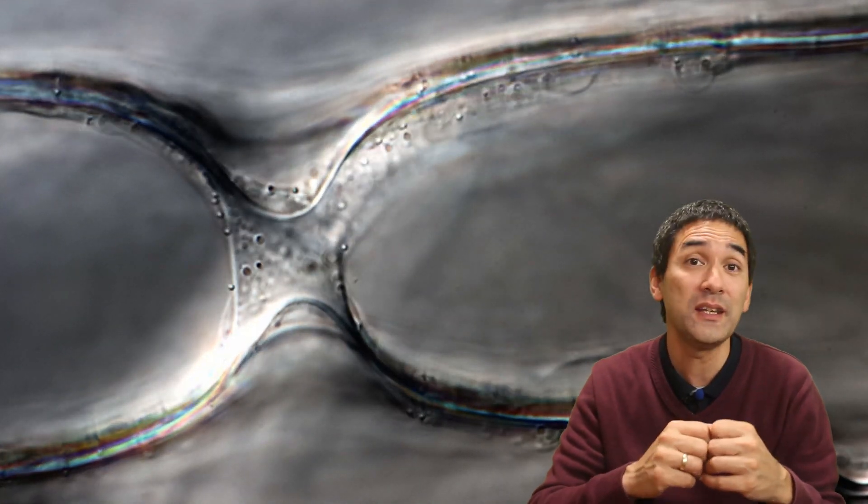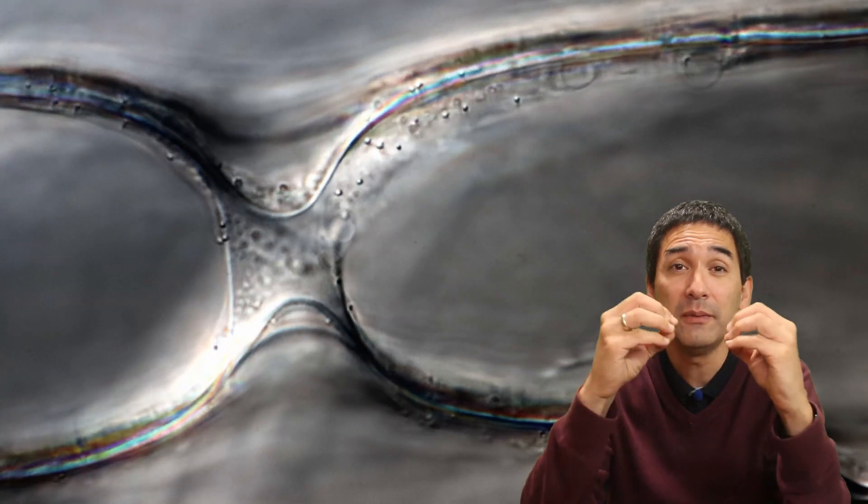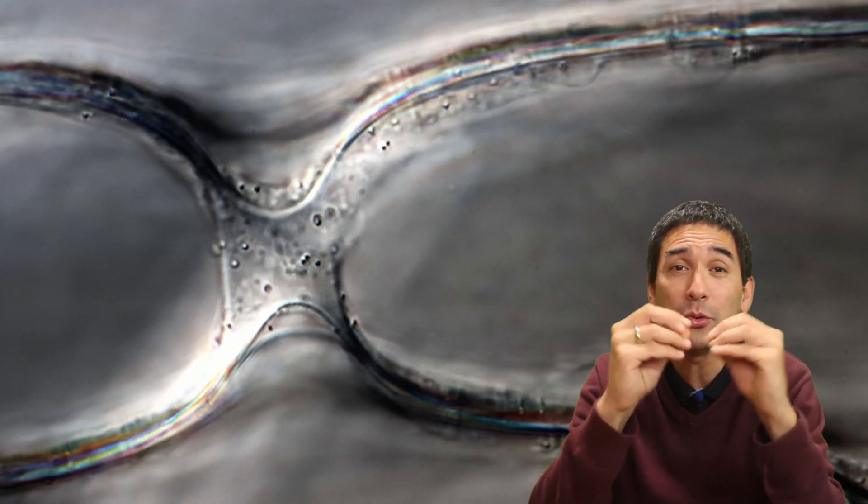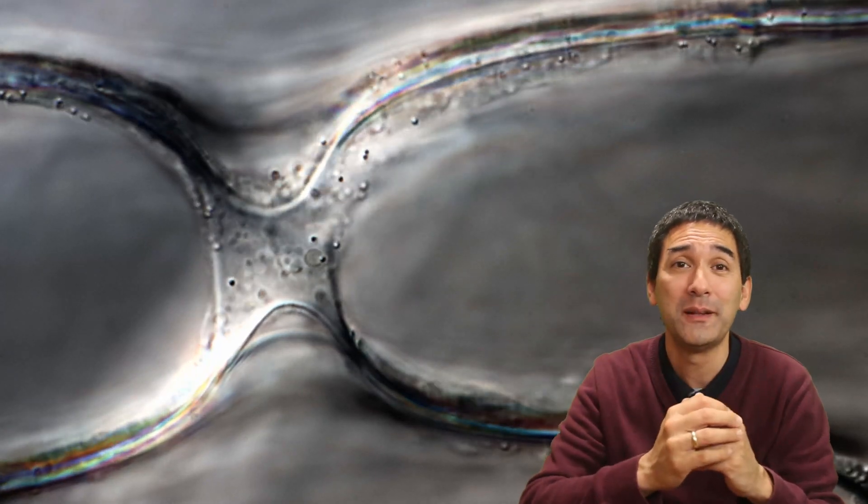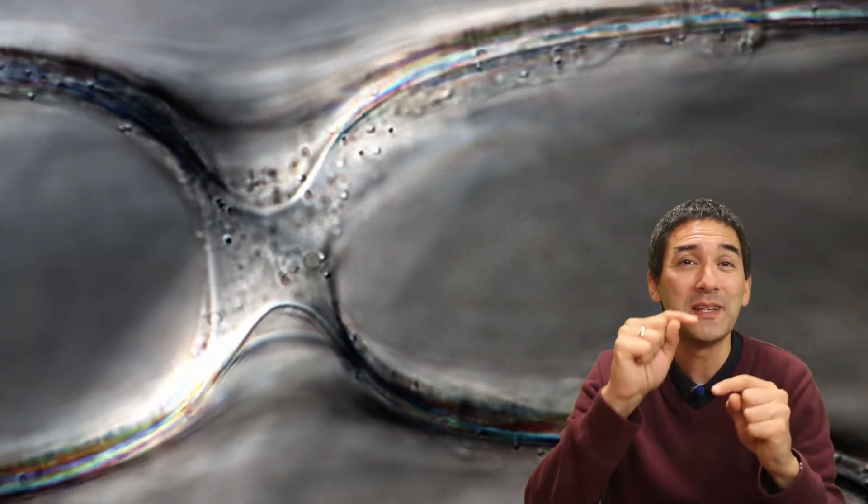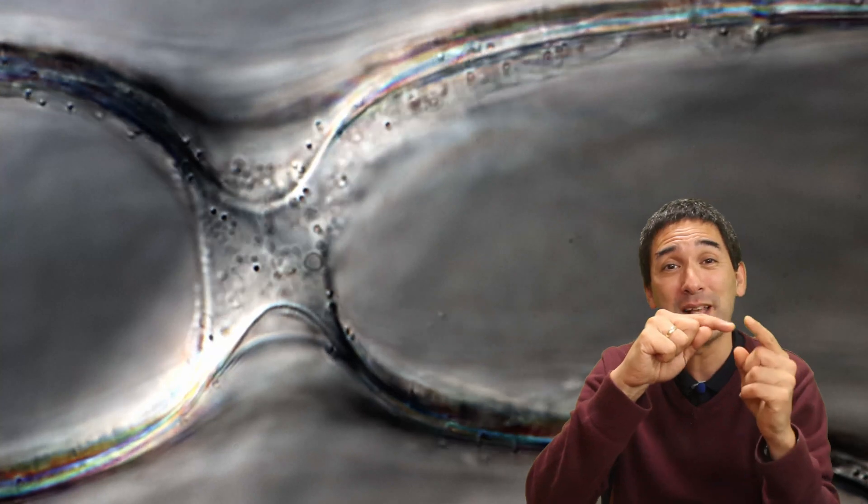Over here, also quite interesting, I could see that two cells were touching each other but they seem to be connected a little bit as well. The cell wall did not entirely separate them. If you look carefully, you can see that some of those vesicles are actually able to pass from one cell to the next cell.